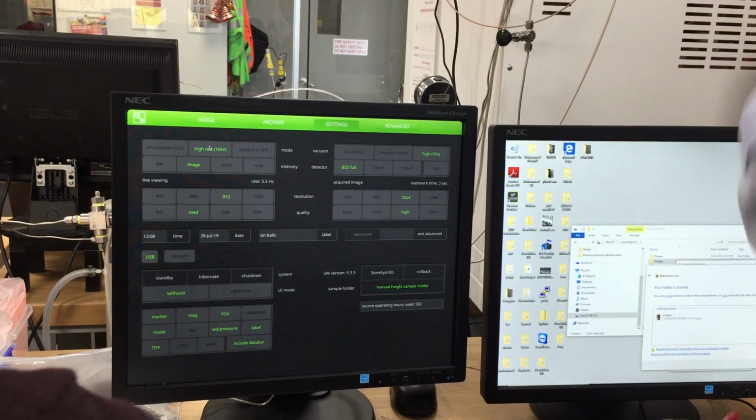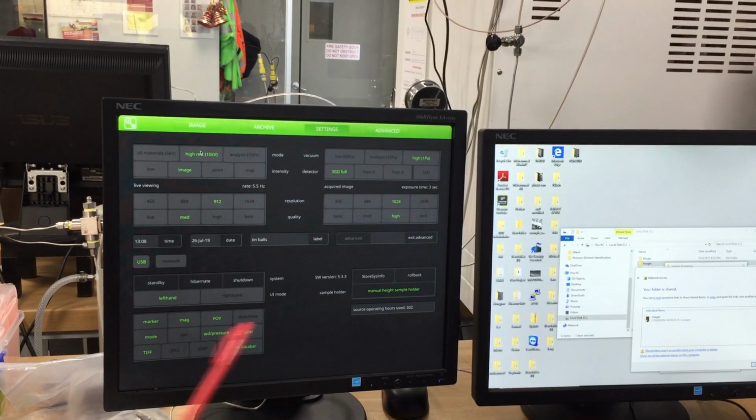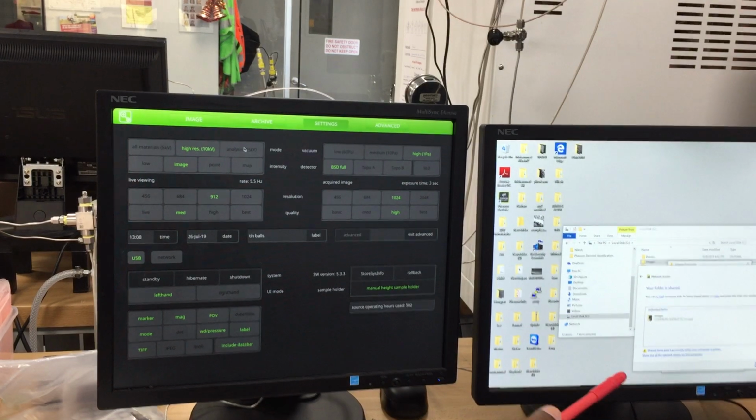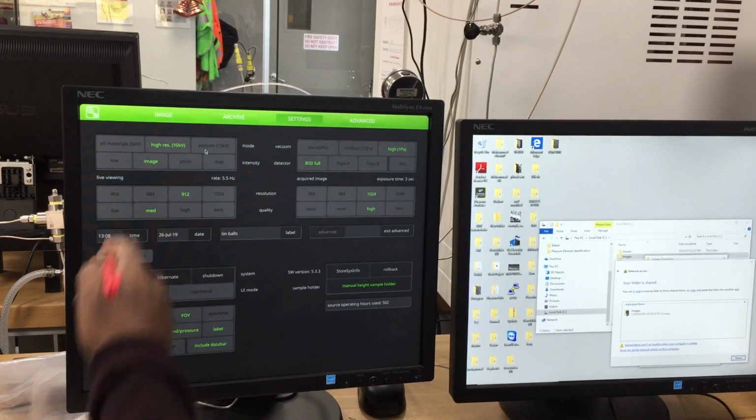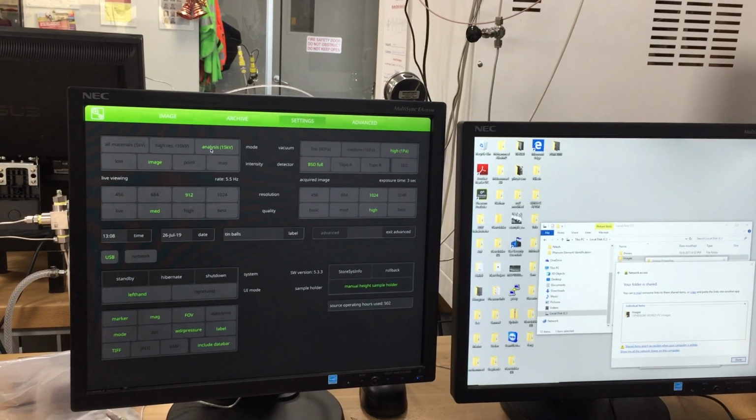But for most of the samples that you normally handle... well, let's put it in later, okay? I'm saying those are the types of sample. Let's put it in and we can see later. I can't predict yet how it is going to be.